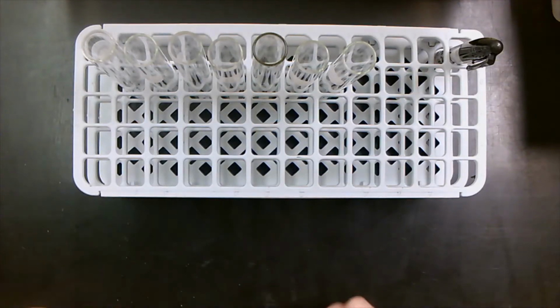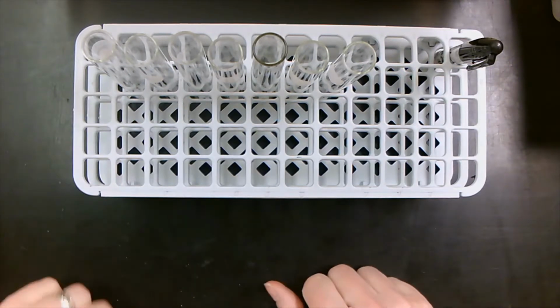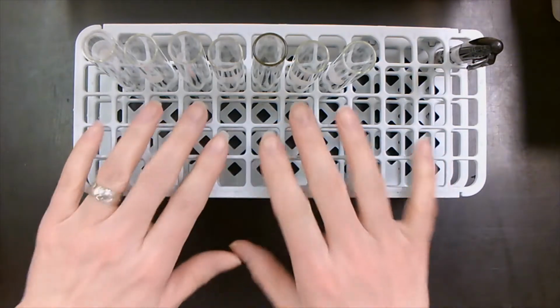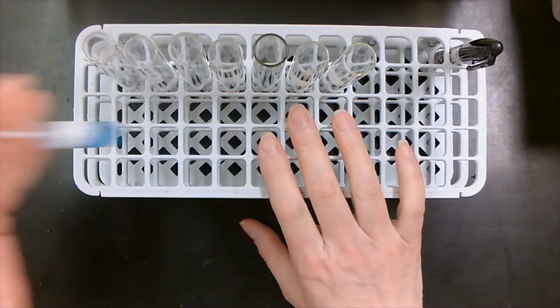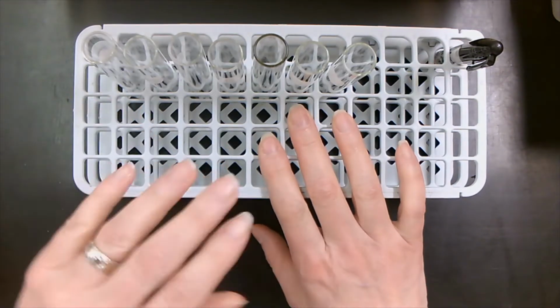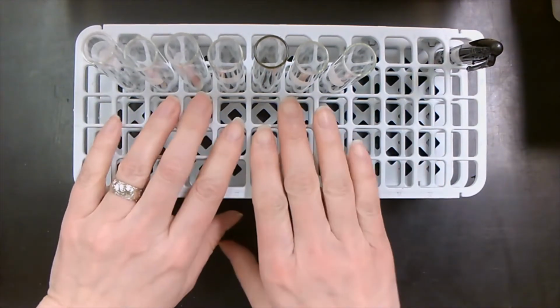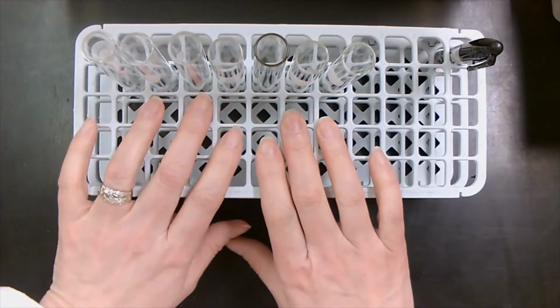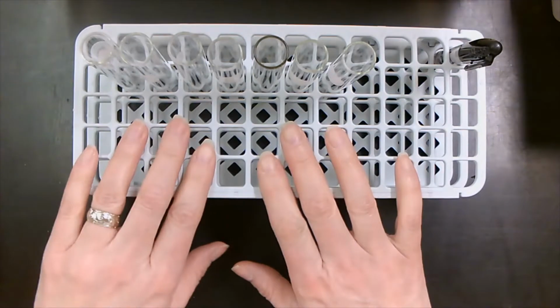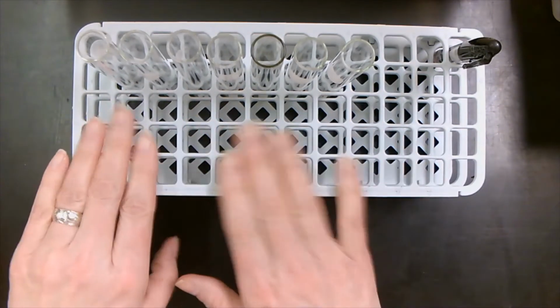Hello. Today what we're going to be doing is an identification of glucose. The indicator that we're going to be using today is called Benedict's solution. For this one we will have to put the test tubes in a hot water bath. The hot water bath is set at 62.5 degrees Celsius so that the Benedict's can actually react with the glucose.